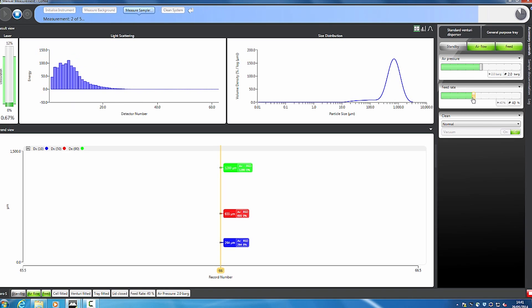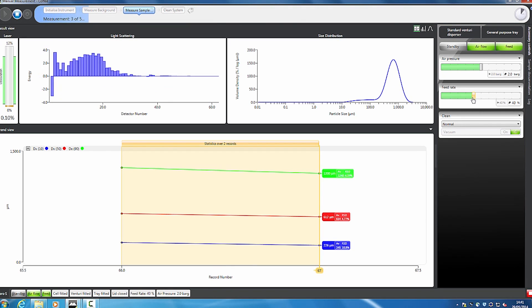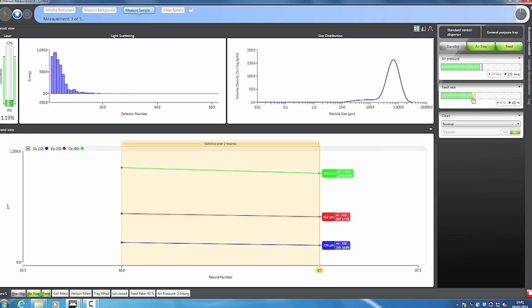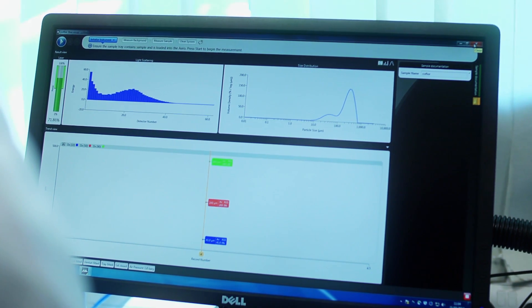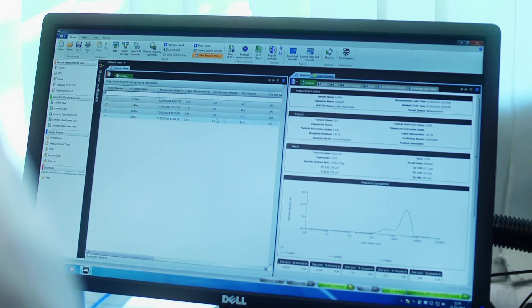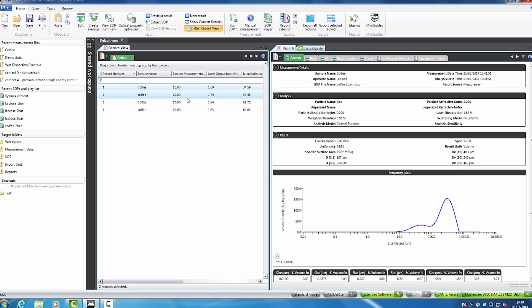Once the sample feed starts, the software automatically triggers the measurement. Live reporting of the results is then provided, so you can be sure that the measurement is operating optimally. The measurement runs until all of the sample is measured, ensuring representative results are obtained. Once the measurement is complete, the results can be displayed within the software's record view.